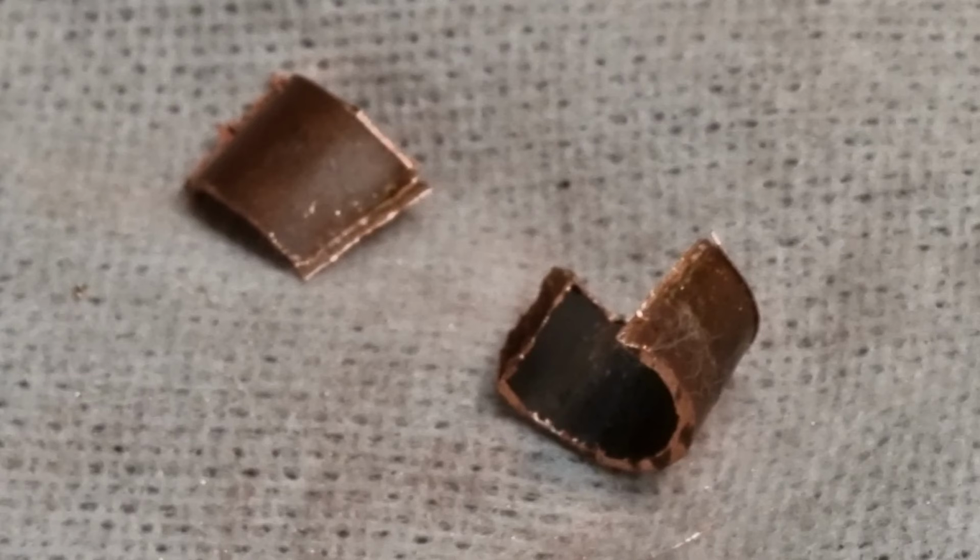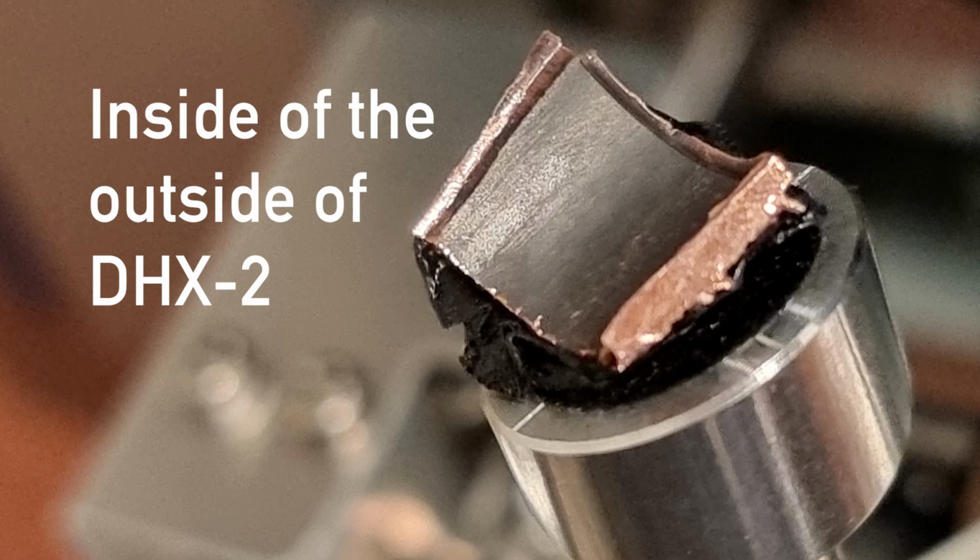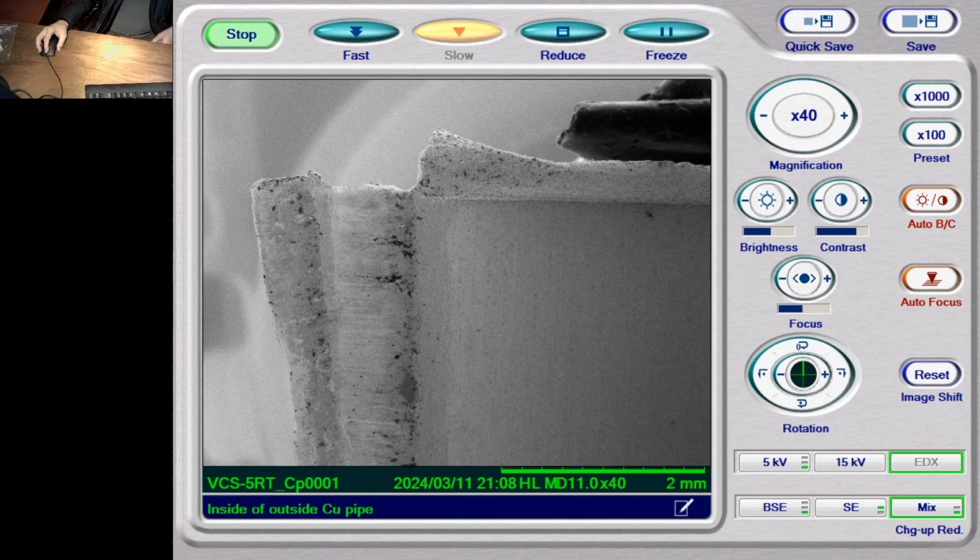So we are looking at the inside of the outside of one of Bin-Juine Huang's cavitation systems, the copper pipe heat exchanger, and this is up here, the carbon tape that is holding it onto the sample holder, and this was cut. So it is a quarter section of the pipe, and we're going to look at the inside area here and see what we can find.